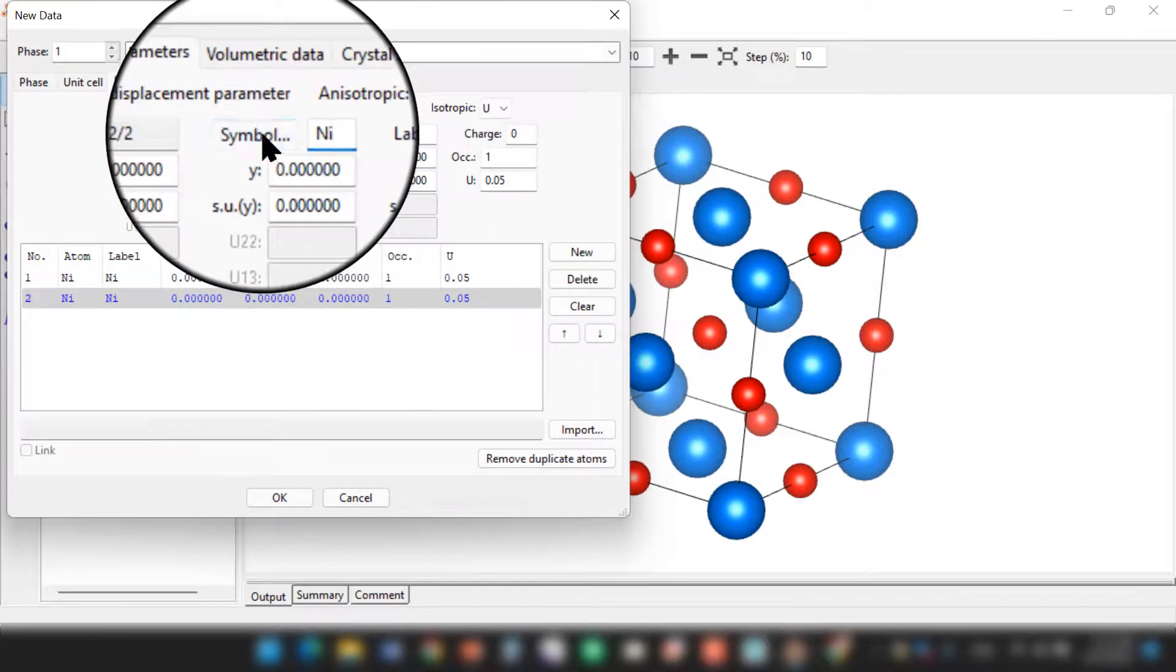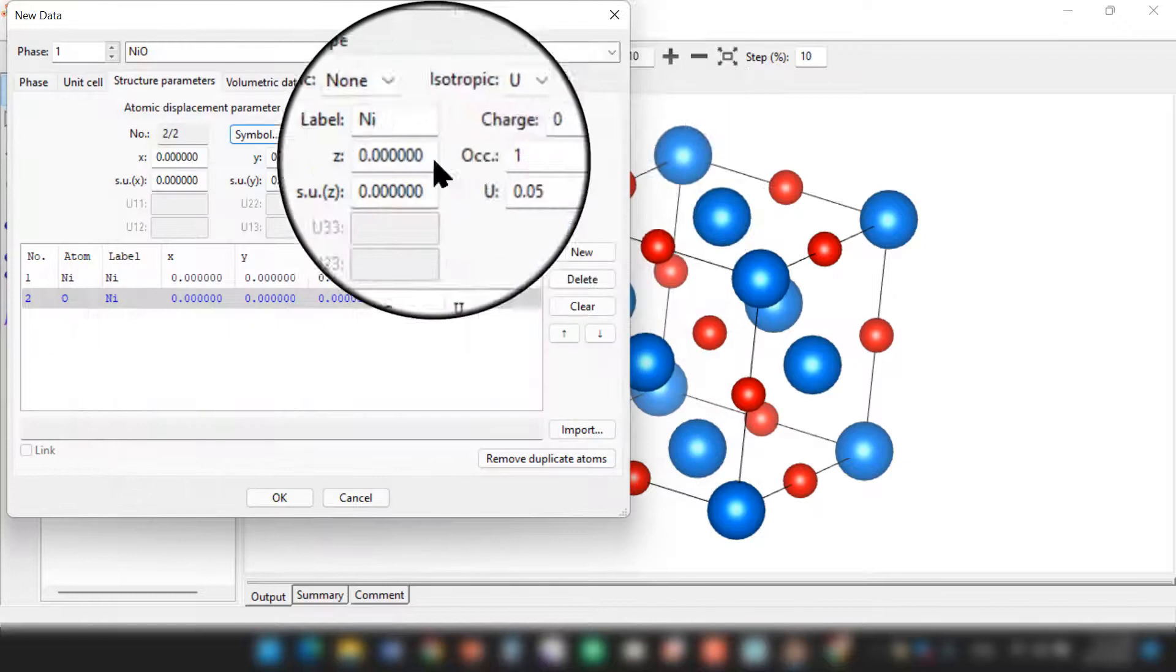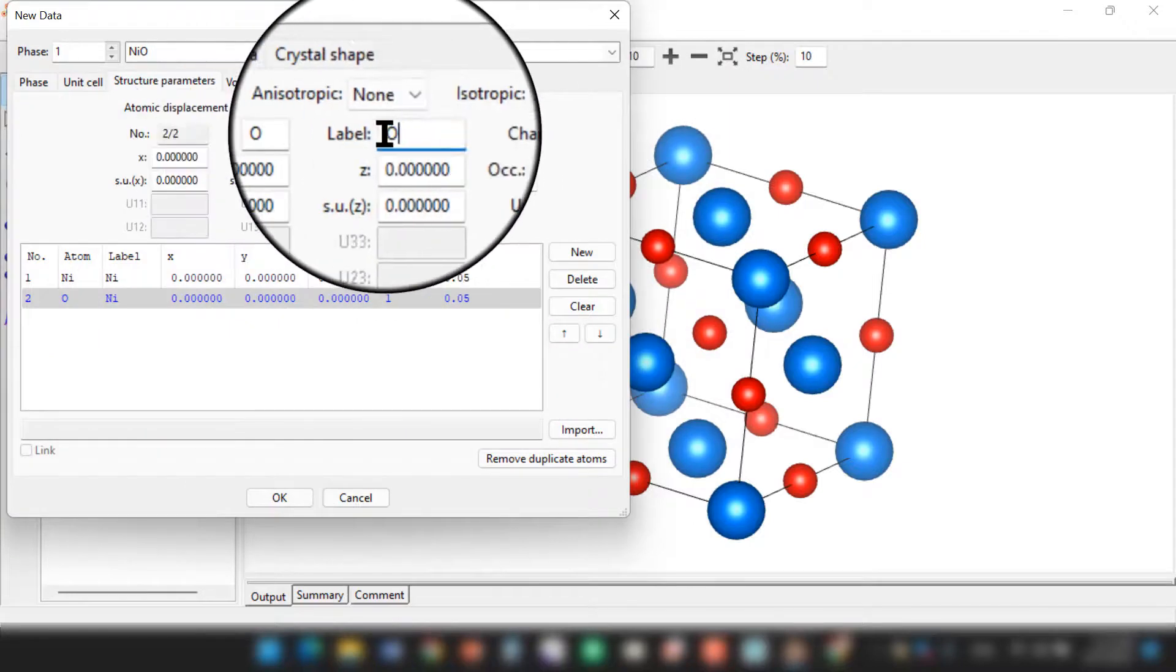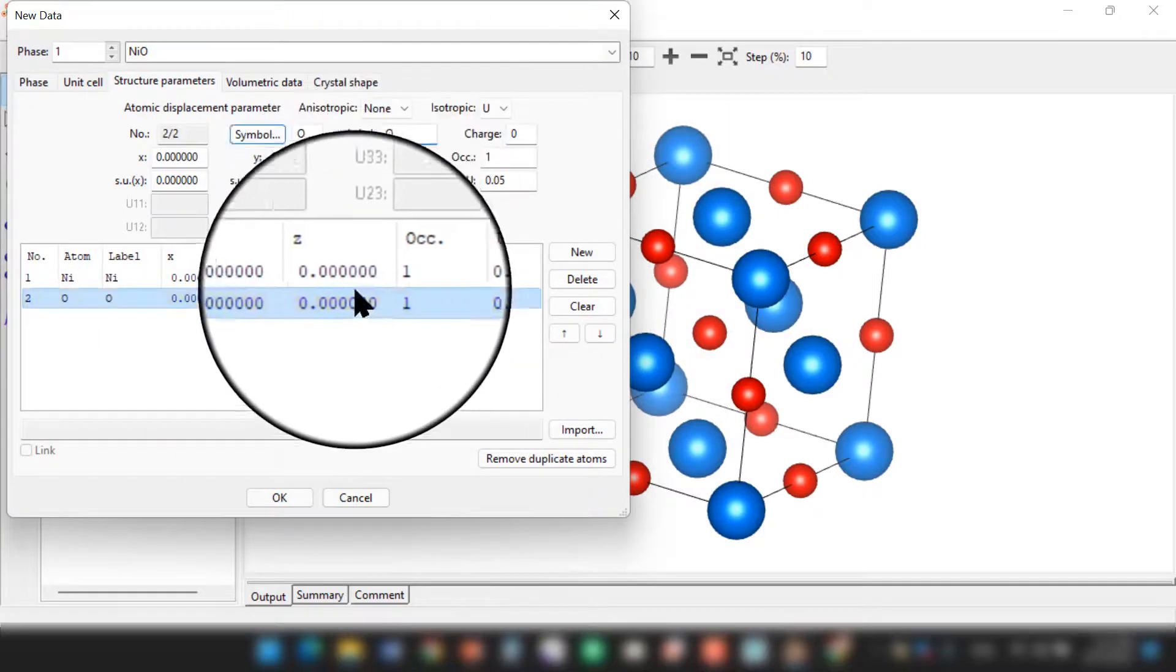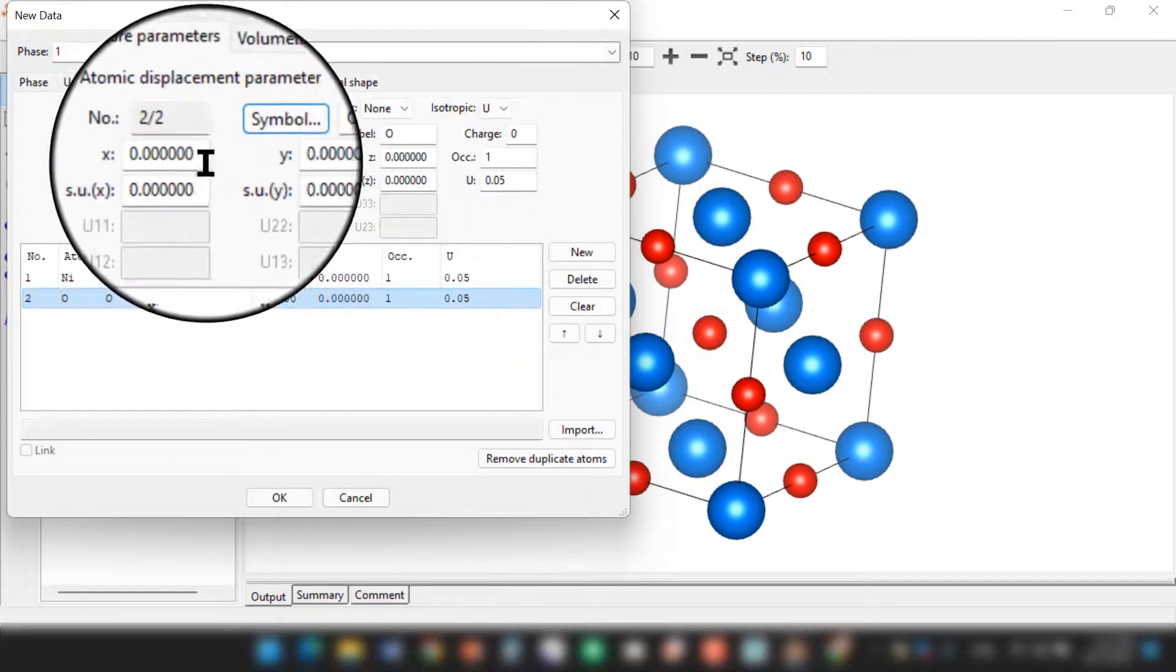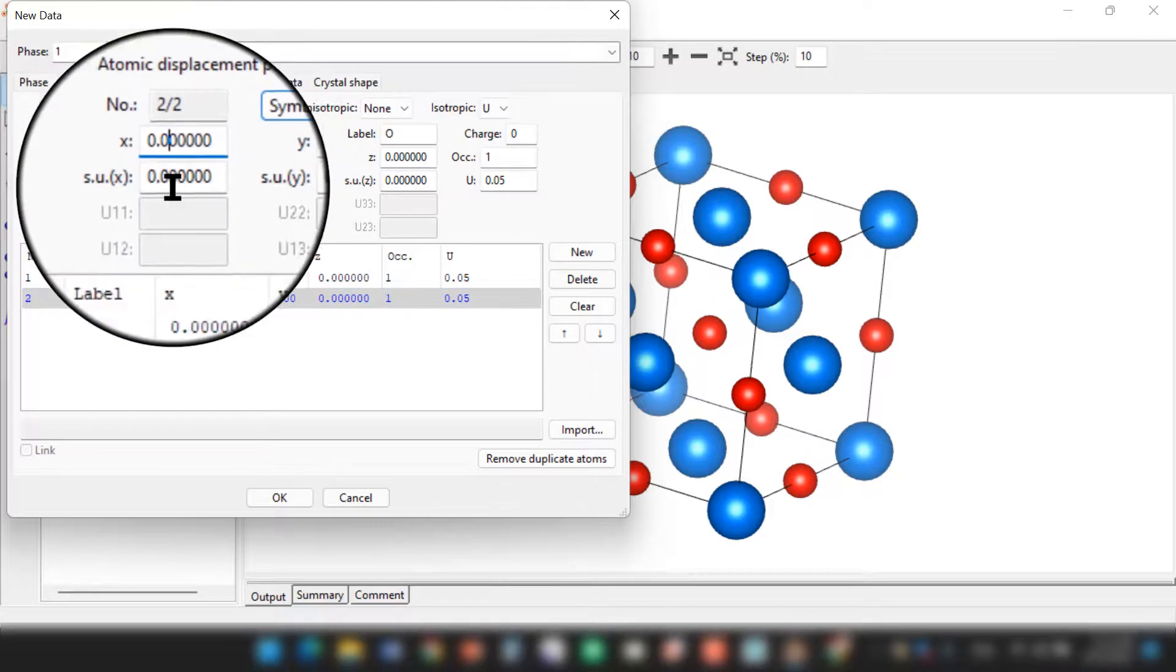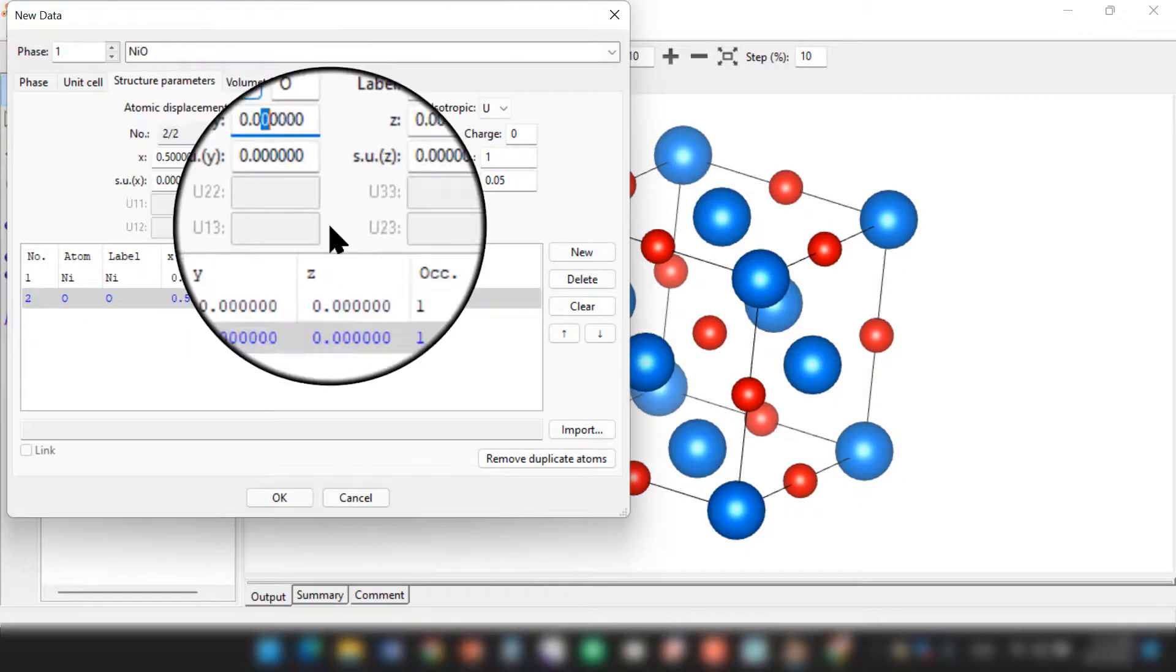Now this time we need to select oxygen. Label it as oxygen. But in this case, your XYZ is 0.5, 0.5, and 0.5 - that is 1 by 2, 1 by 2, 1 by 2. So write down the Cartesian coordinates accordingly.